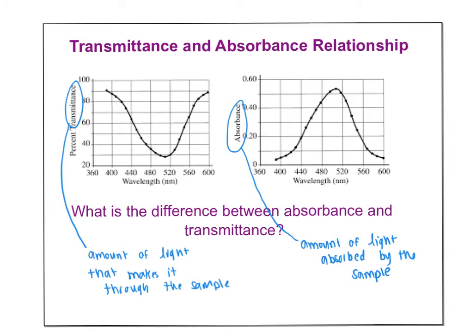So these are wavelengths. This is what we set our colorimeter to when we look at that color wheel. And when looking at a graph, let's say you don't have the color wheel in front of you, and you don't need to memorize it, but what if I gave you graphs like this and asked you what wavelength should we set our colorimeter to? Well, what we're going to look for is maximum absorbance.